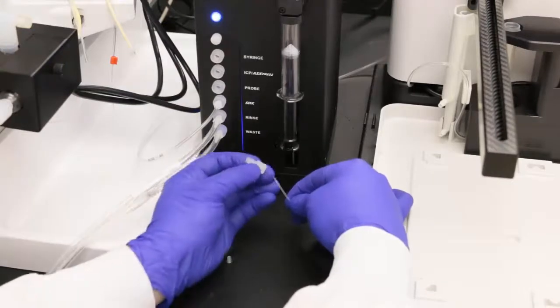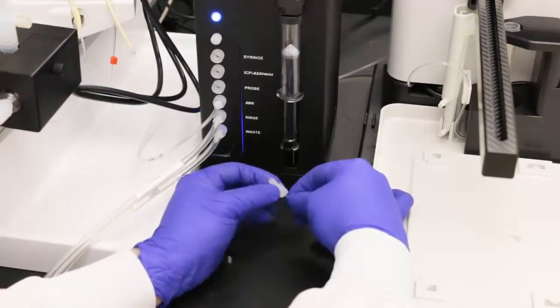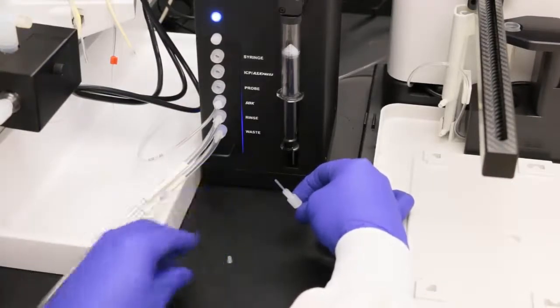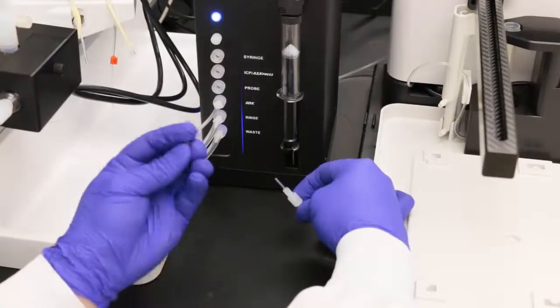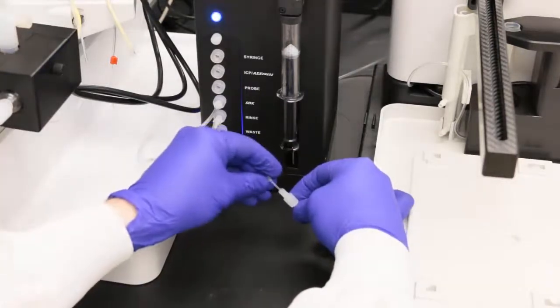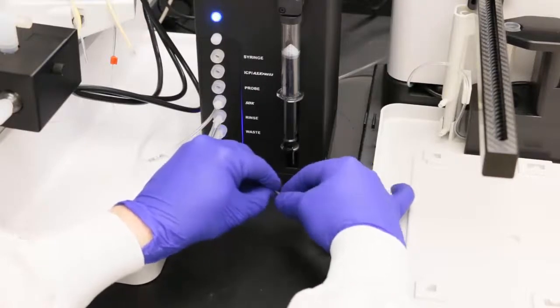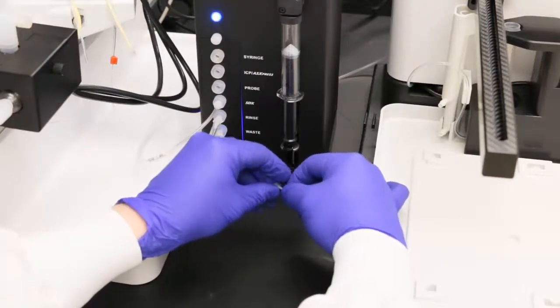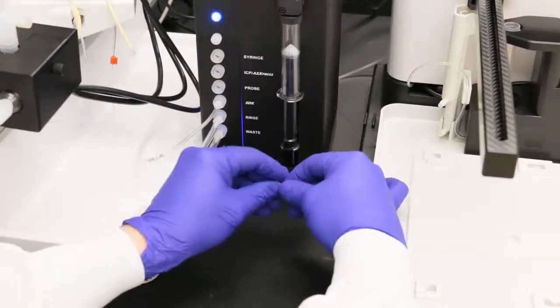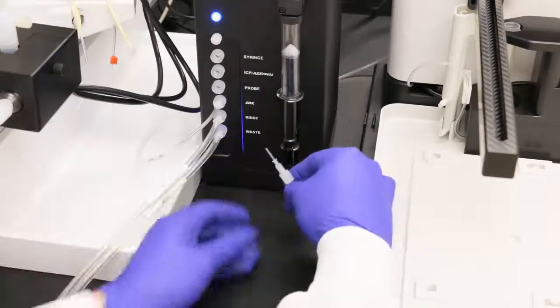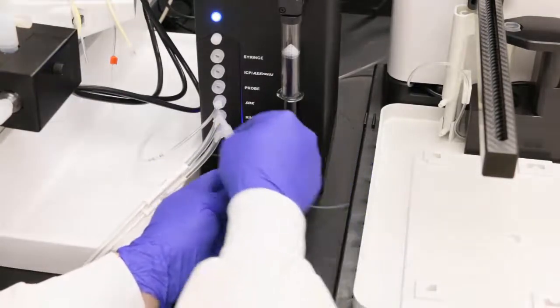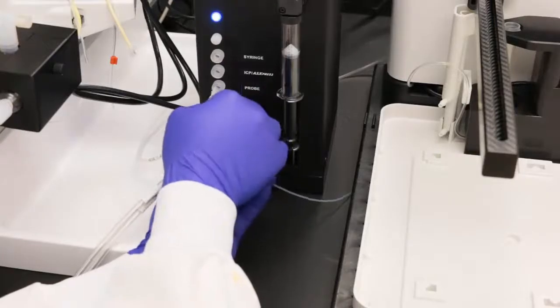Install the nut and ferrule on the end of the sample probe tube. The flat end of the ferrule should face the end of the tube. Now connect the sample probe to the probe connector.